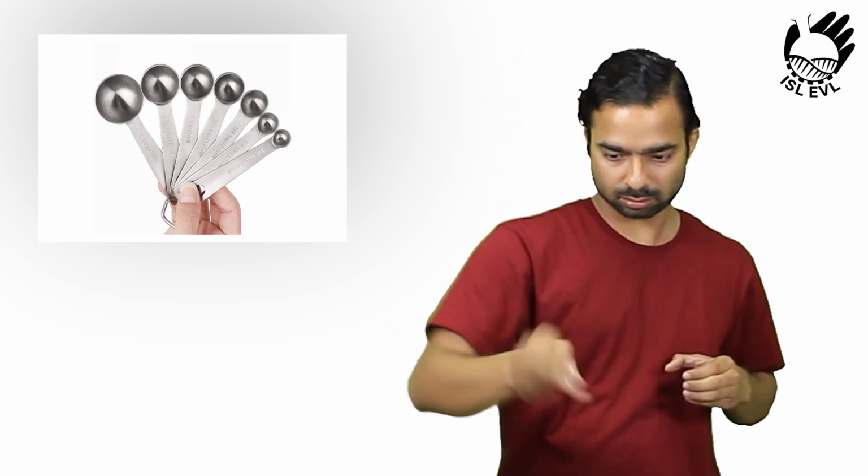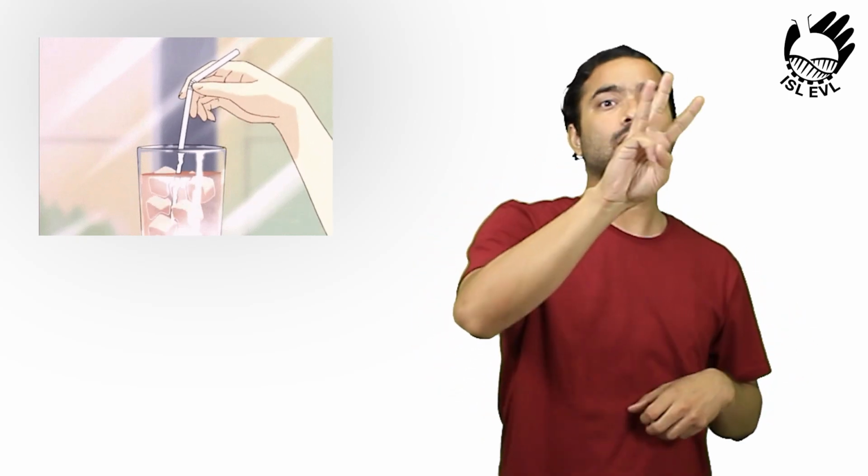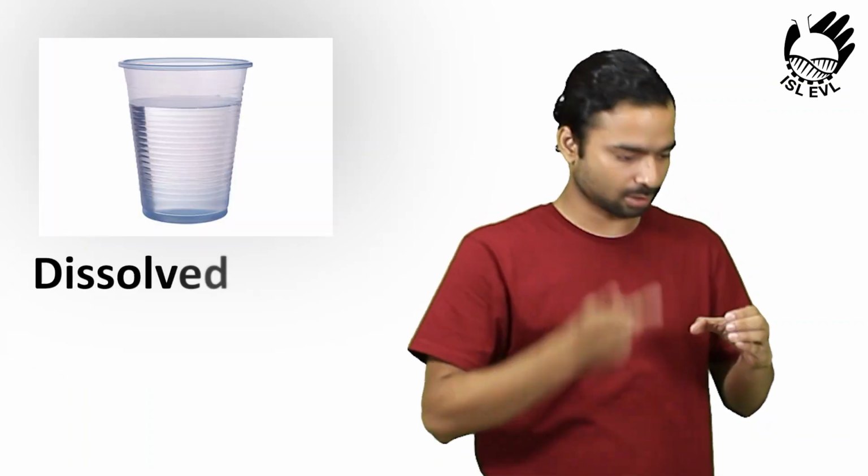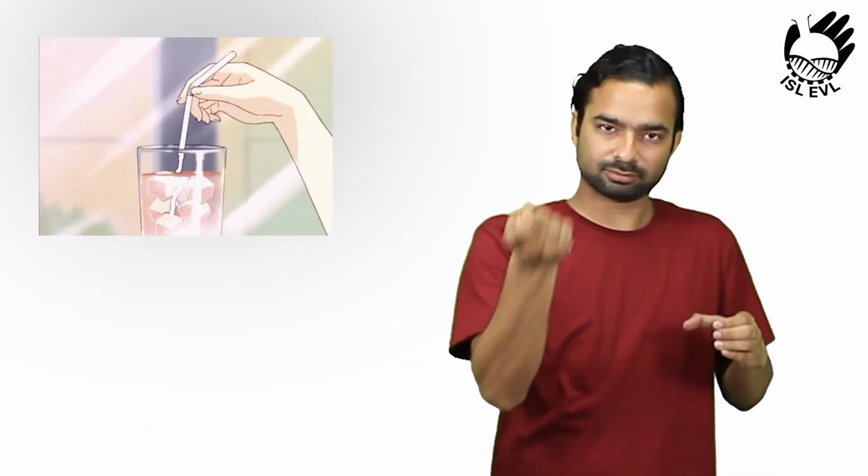After buying the materials, the procedure we need to follow is: 1. Accurately measure 40 cm³ of cold tap water into a clear plastic disposable cup and record its mass. Record this in the student worksheet provided A.